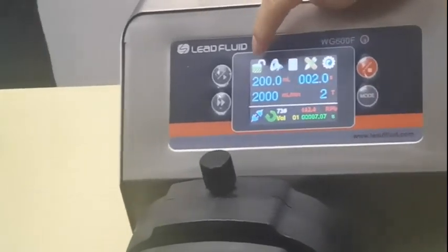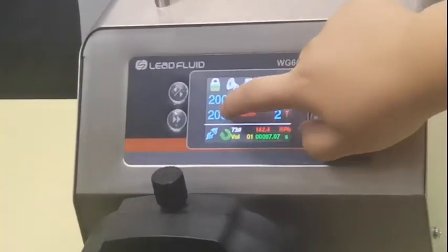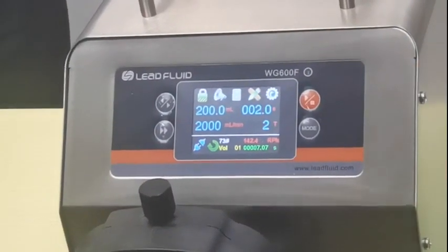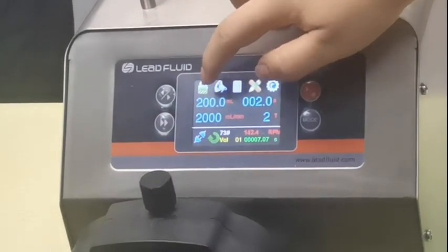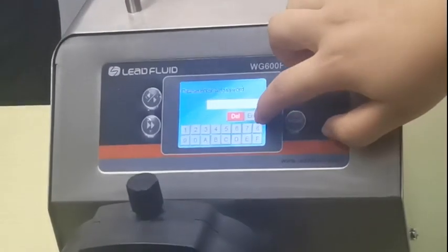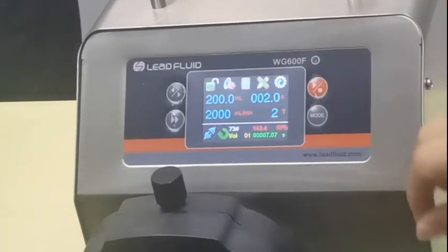There is a lock function — when you lock it, you cannot change any settings. There is also a sound setting.